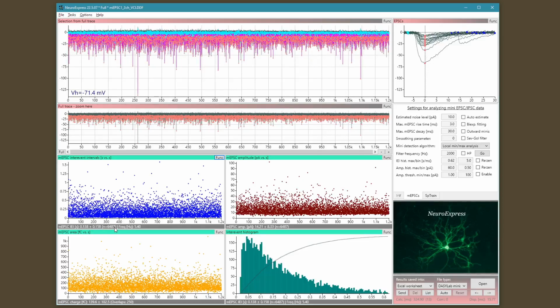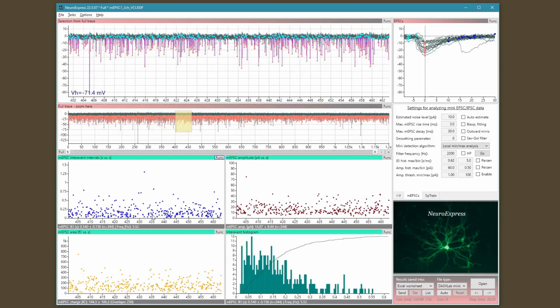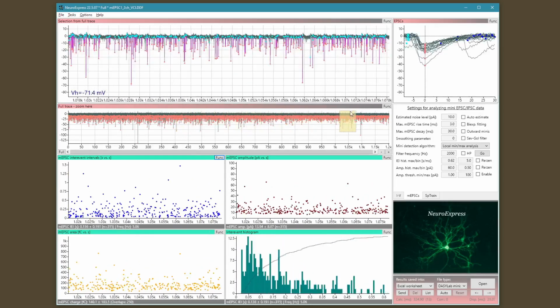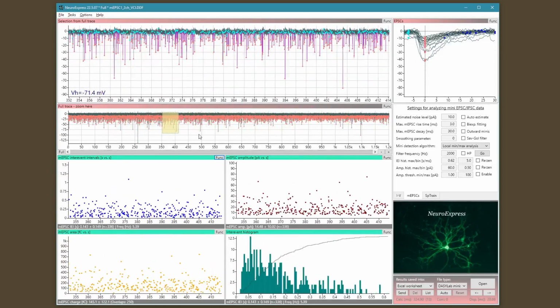It will also show some numbers like 6,487 events are shown within this plot. Of course, if you zoom into a narrower section, then the number of events will be much smaller. The average or mean event rate is also updated here. In this example, the event rate was approximately 5.5 Hertz. But if you go through, then you can see that this number is continuously updated.